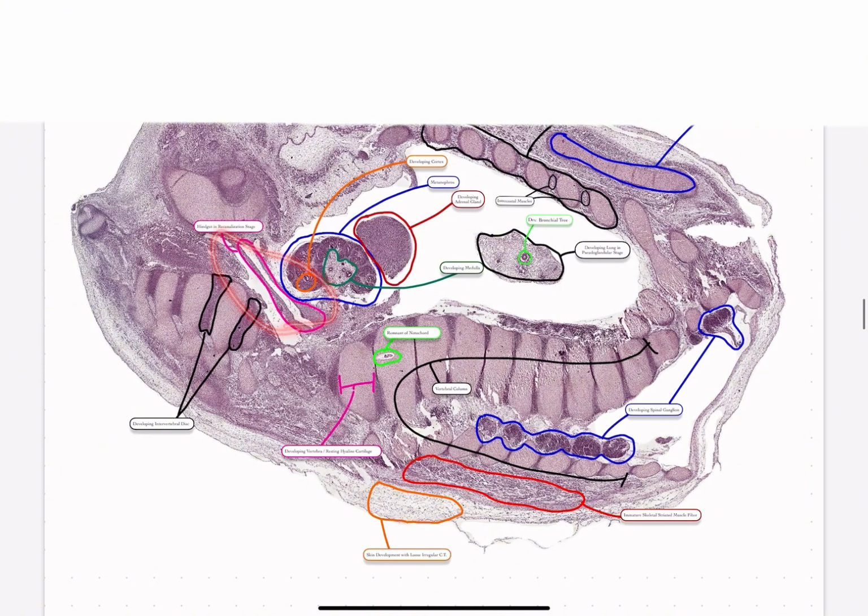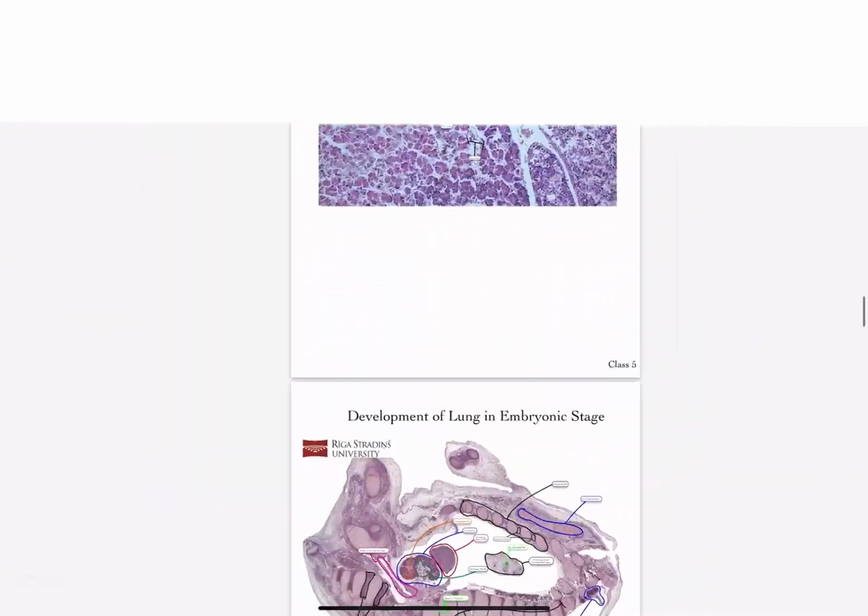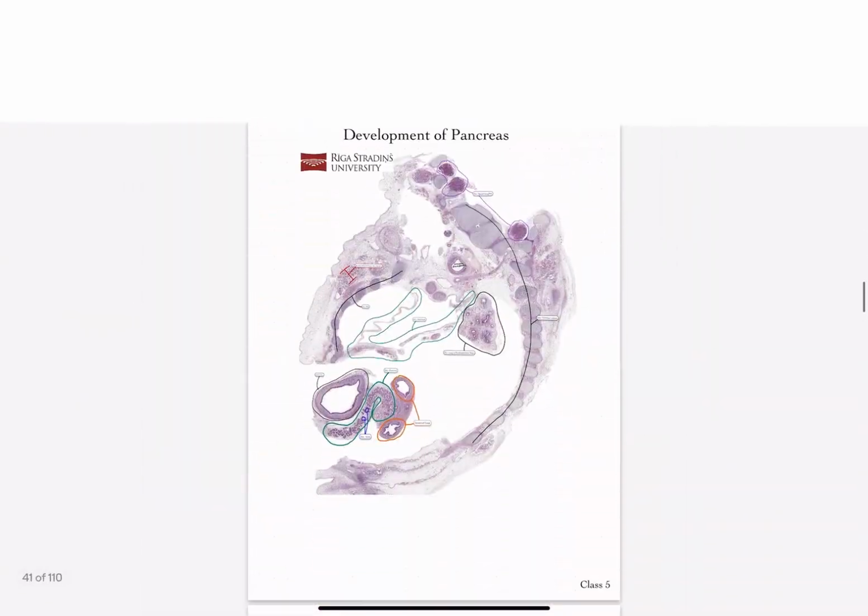Here we go. This is the hindgut. We did talk a little bit about it in colloquium 1. Kind of looks like a dorsal aorta, just more towards the bottom of the embryo. But again, it's kind of hard to recognize and distinguish it from the dorsal aorta.